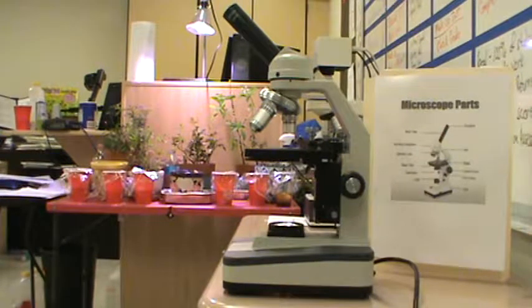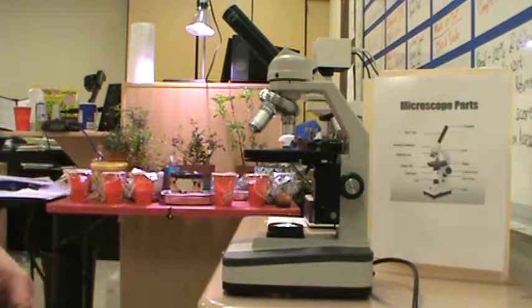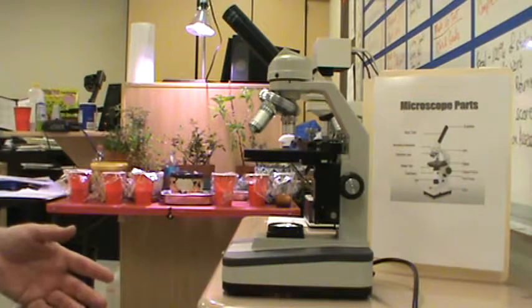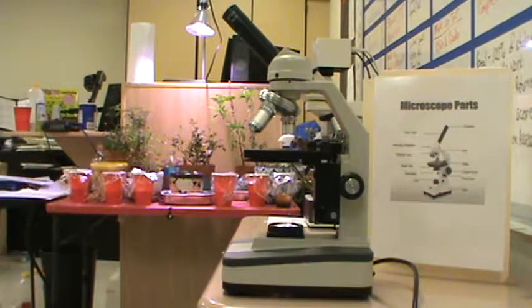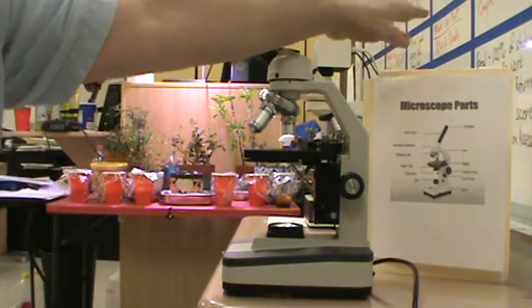Today's topic, microscopes. In our biology classes here at Hobbs High School, the microscope is one of the most important tools that we can use in order to examine things that are very small, one-celled organisms, pieces of tissue. We use the microscope to examine things that are very small. Micro meaning small, scope is to see.